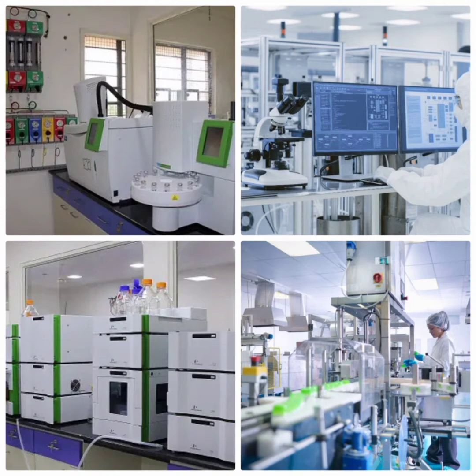If it comes to operating temperature, HPLC separations are mostly carried out at ambient temperatures, whereas gas chromatography separations are carried out at elevated temperatures, which can be held at a constant value, meaning isothermal, or variable as decided by the temperature program. Newer technologies have extended the temperature limits of high-performance liquid chromatography operation as well.